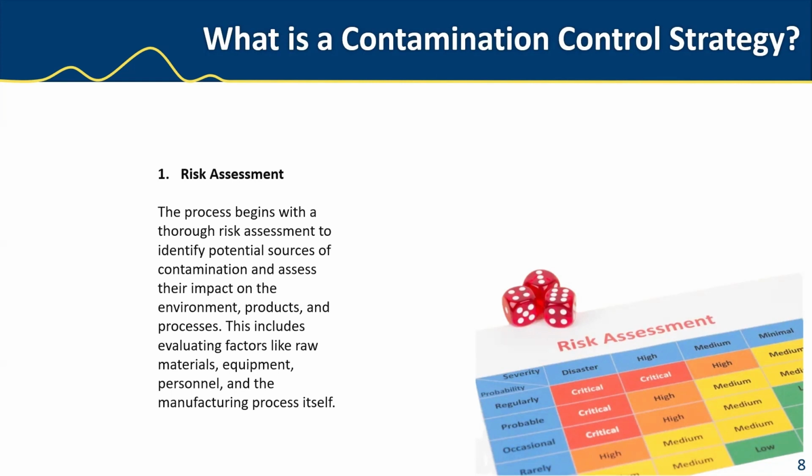And it's put into a risk assessment. I'd recommend ICH Q9. Follow that guide on risk assessments. I do have separate webinars on how to develop a risk assessment in our past webinars. You may want to jump on and have a look at some of them. But it is a holistic approach.